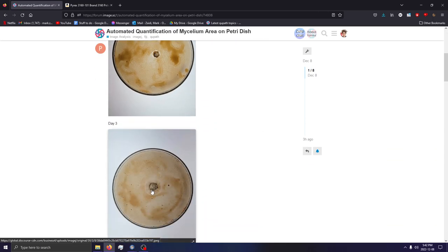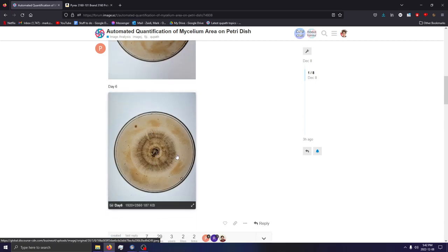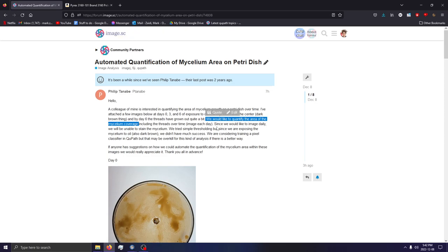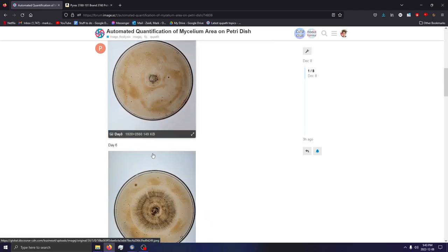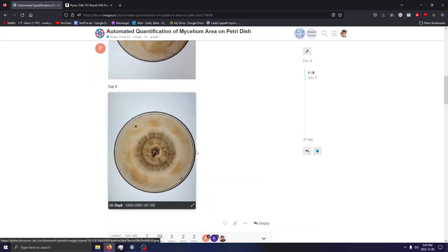Theoretically, we could create a pixel classifier that combines area measurements of both the central mycelium mass and these threads — which I'll call hyphae. They want to image daily but are unable to stain the mycelium. My first recommendation was to stain with a dye that has an affinity for chitin, since it's a key component of fungal cell walls. They've tried simple thresholding, but since mycelium is being exposed to oil — also dark brown — they didn't have much success, so I might recommend something along the lines of deconvolution.